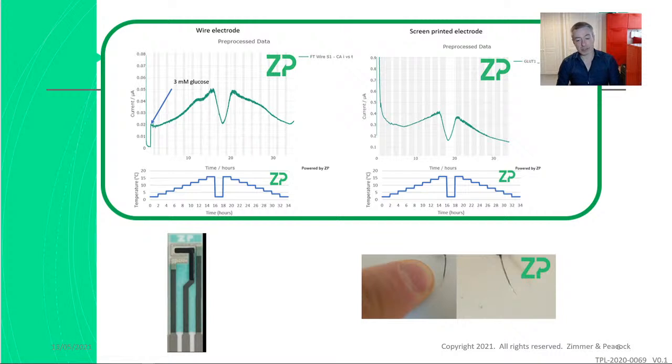So let me get back to the original question now. The original question was, why does temperature affect your pH sensor? And as I said, I misread it as, why does temperature affect your glucose sensor?